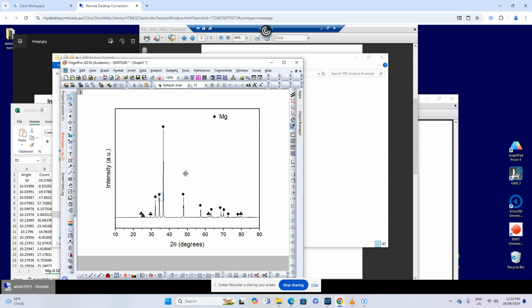It corresponds to the other phase. So I will copy this one, bring this one here. So I will write magnesium 17, strontium 2. And I will make them like a subscript, and there we go. So this symbol corresponds to magnesium and the other symbol corresponds to the other compound.